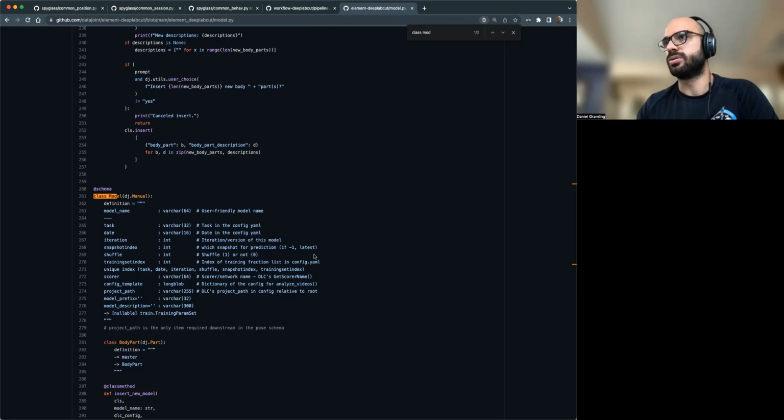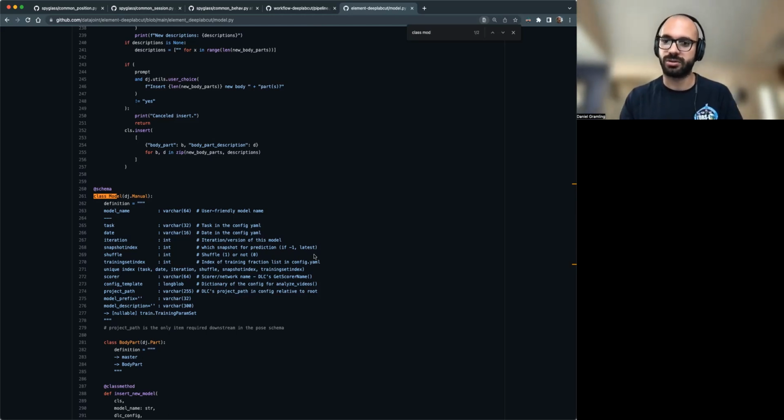Could you, I guess, see an easy way to integrate that with model training? Or is there a way, or would that be the type of thing where you suggest forking and editing it and then adding a dependency upstream? I guess if we wanted to, a more general question would be, if we wanted to have other upstream dependencies, what would be the best way to implement that outside of VideoSet and the other things that are expected, like session and subject?